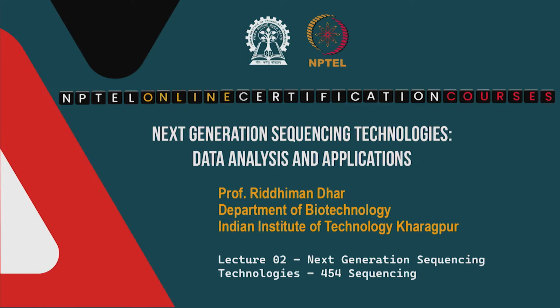Good day everyone, welcome to the course on next generation sequencing technologies, data analysis and applications. In the last class we talked about next generation sequencing, and from this class we will now introduce the technologies themselves, and we will discuss how these technologies have accelerated the pace of genome sequencing and provided this high throughput sequencing.